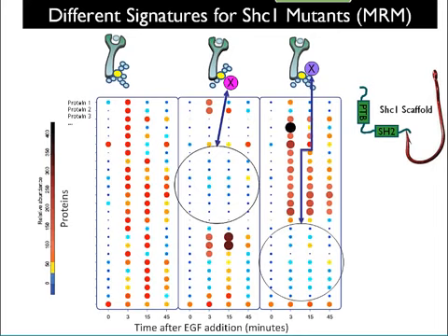Now, one of the issues with this is it took us years to make this MRM assay. Very exacting. Our technologists are superb at what they do, and it requires a lot of babysitting, if I may use that word. So it would be better if we found a better way than just identifying proteins to start creating an MRM assay. And of course, the obvious way to do that is with SWATH, because SWATH is non-assumptive and easy. And by easy, I mean it's a single type of experiment. If you're measuring a Shc pull down or a kinase pull down, or as we'll see in a second, some white blood cell stuff, it's the same exact experiment. It's a commodity, in other words. You can do it again and again and again without any programming.